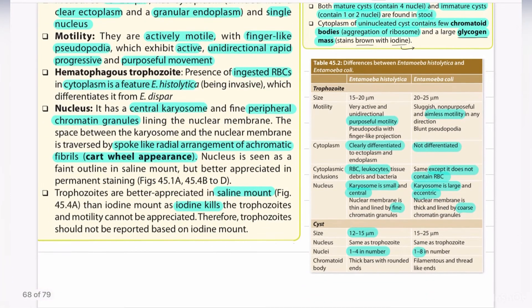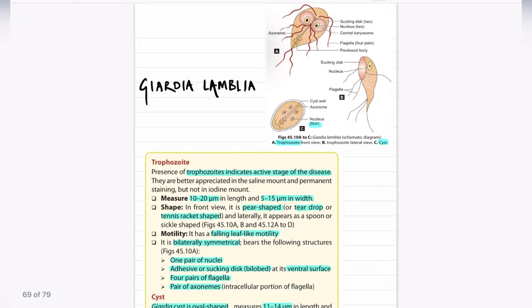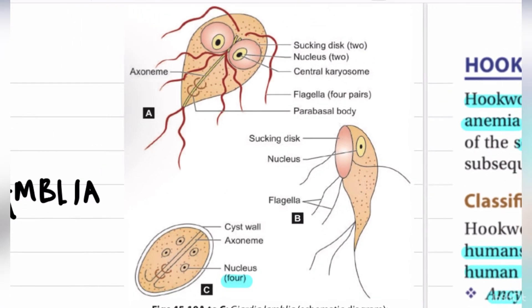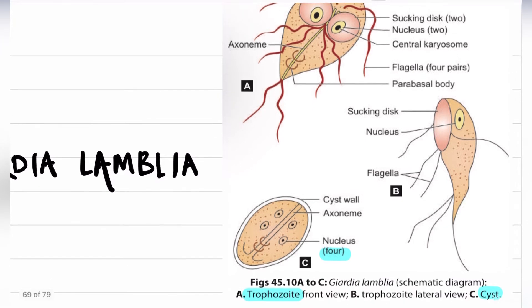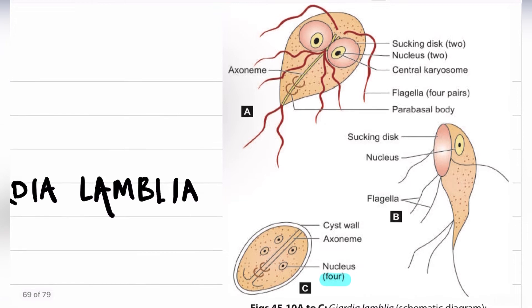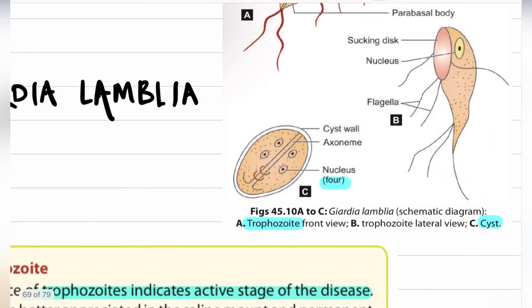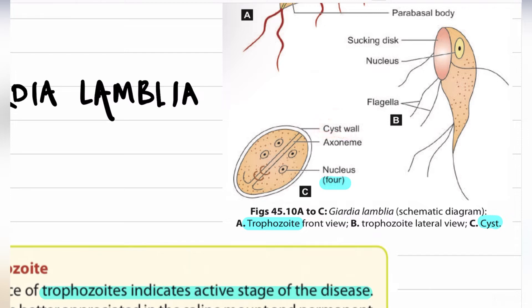Next, we are going to discuss about Giardia lamblia. Giardia lamblia has a trophozoite and a cyst. The trophozoite is characteristically seen with two sucking discs, two nuclei with a central karyosome within each nucleus, and four pairs of flagella and parabasal bodies. This is the side view of the trophozoite.